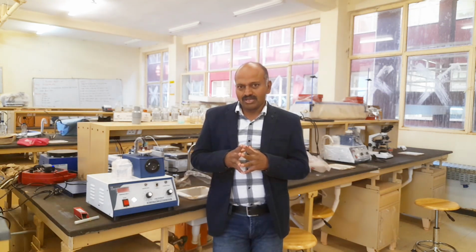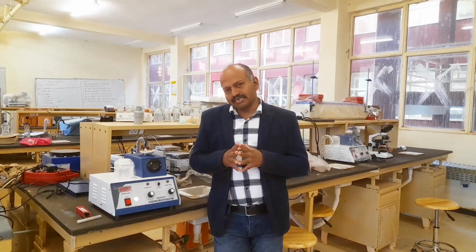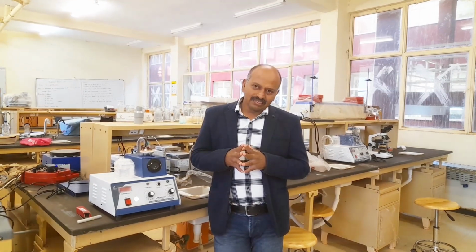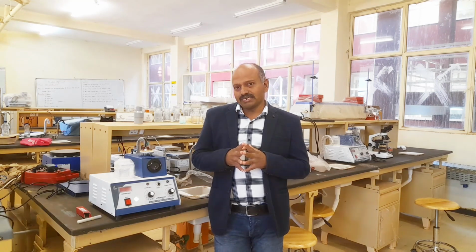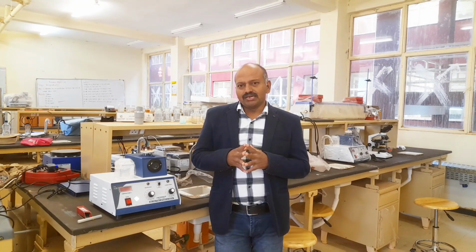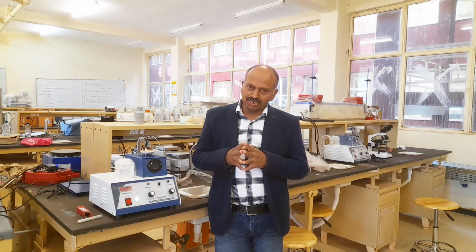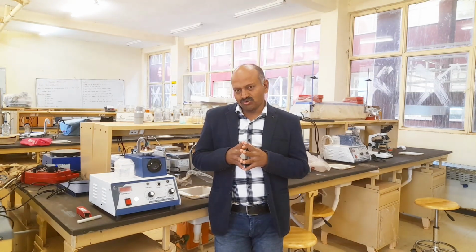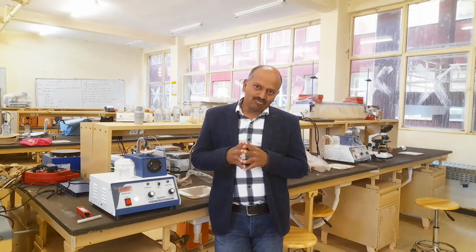This apparatus helps us understand the physical and chemical properties of organic compounds. The factors that affect the melting point are impurities present in the compound, the molecular structure and shape, and the force of attraction between the molecules.